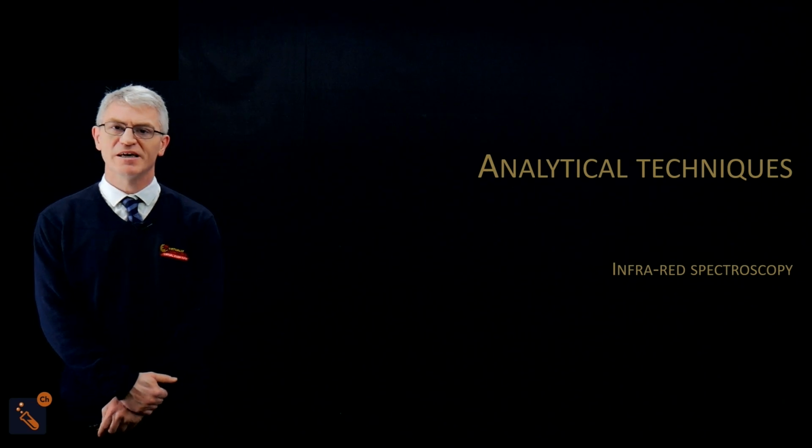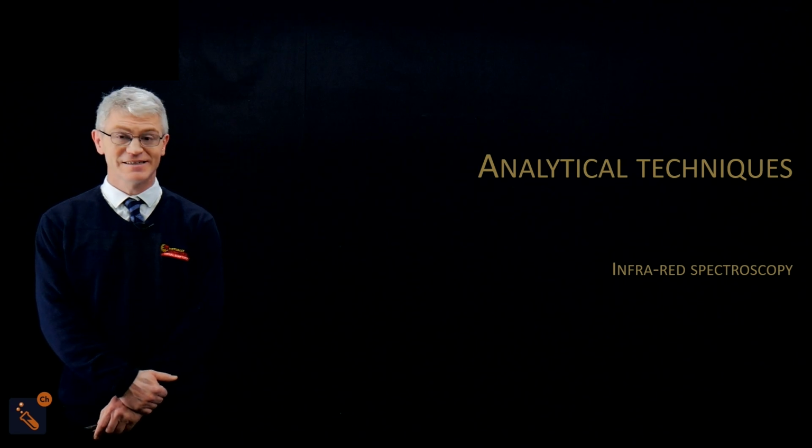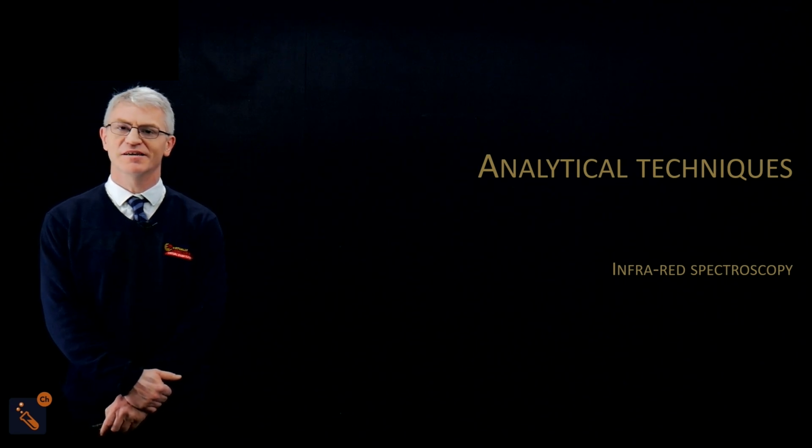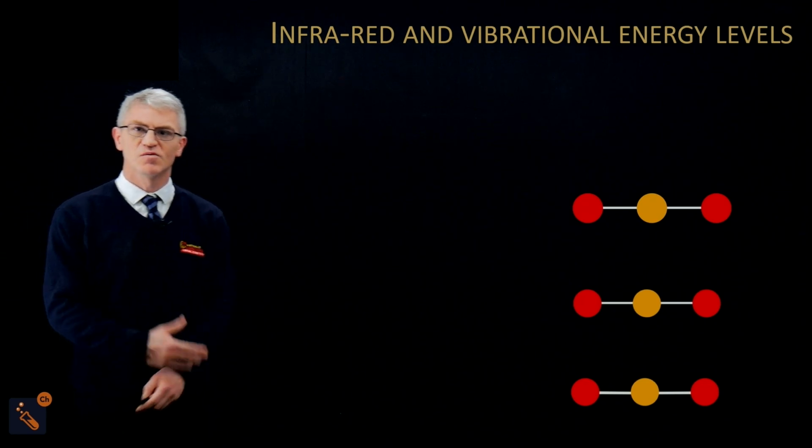In this video, we're going to talk about infrared spectroscopy and how you analyze it to see the type of bonds that are in a molecule, a covalent molecule. So, first of all, what is infrared?